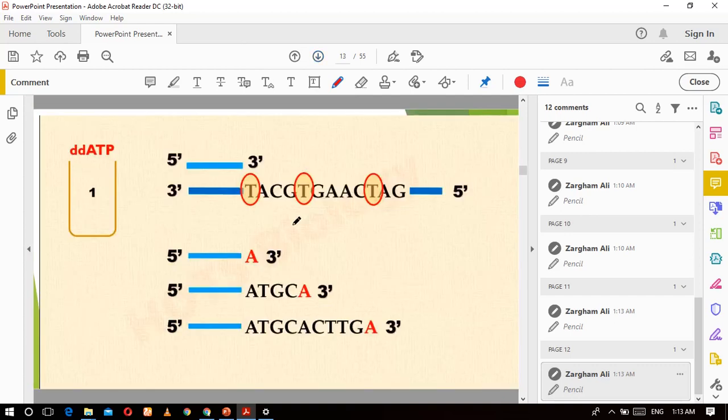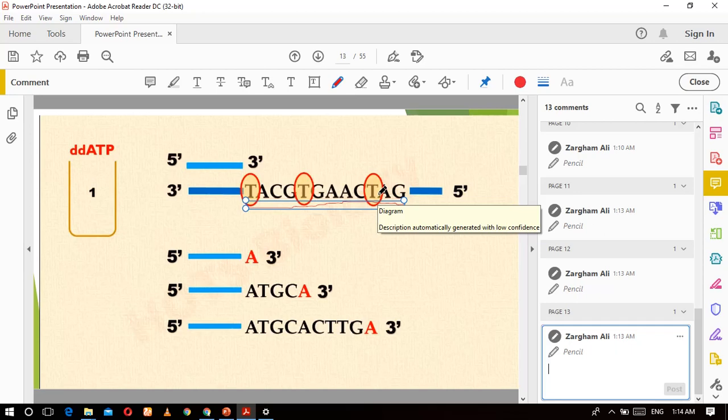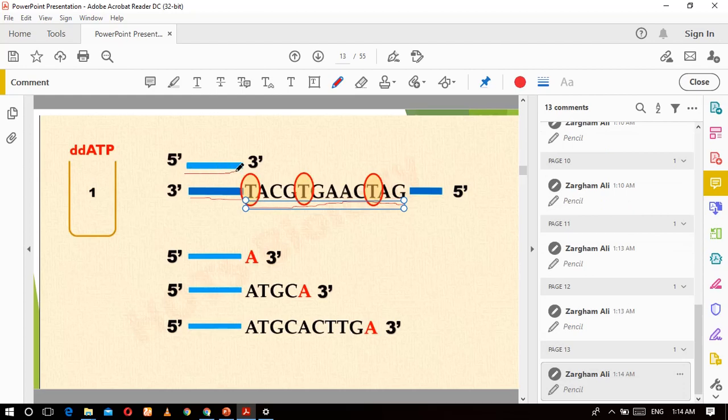Okay, this is an example of Sanger sequencing. Just consider this as our DNA sequence. We still have to sequence our DNA fragment. To understand how this works, we made a random sequence. The actual sequence is not that small; it is generally 200 to 250 base pairs long. This is an engineered sequence so that our primer can attach.